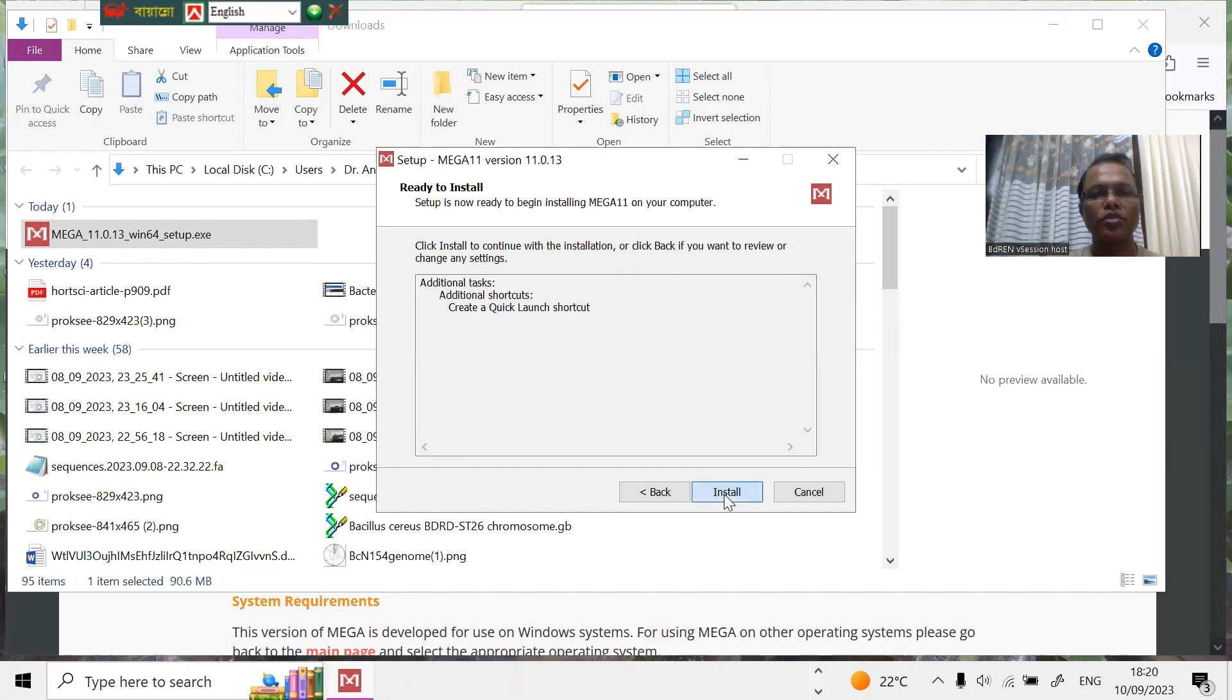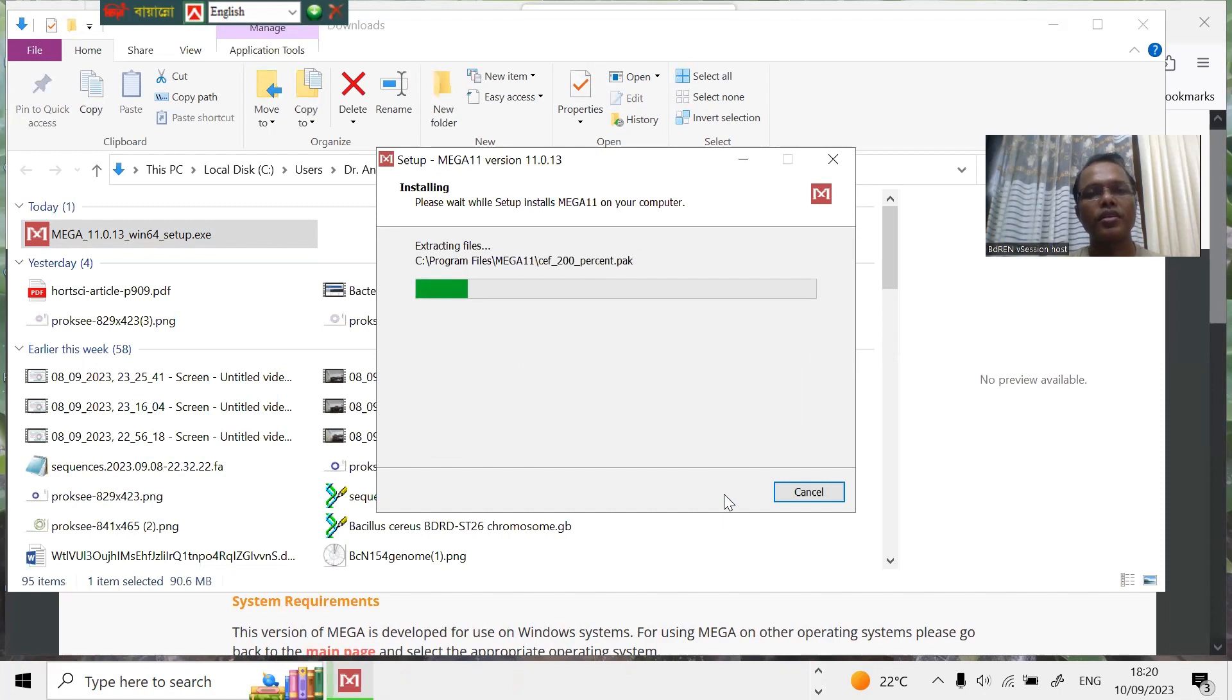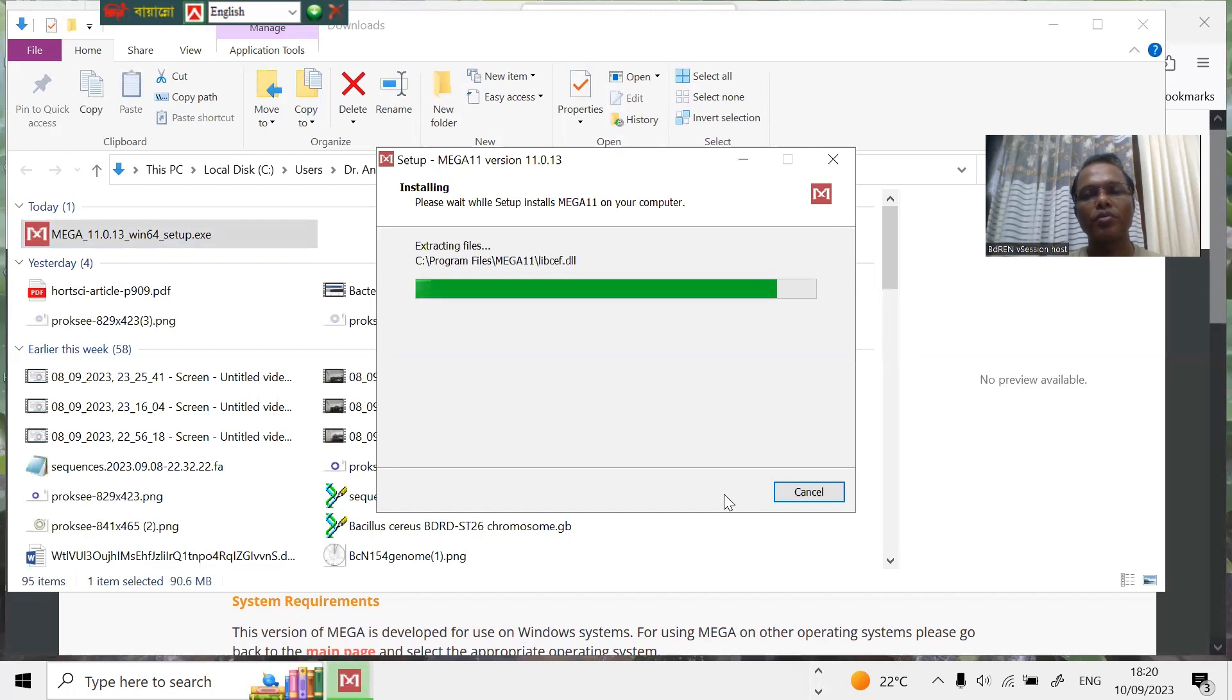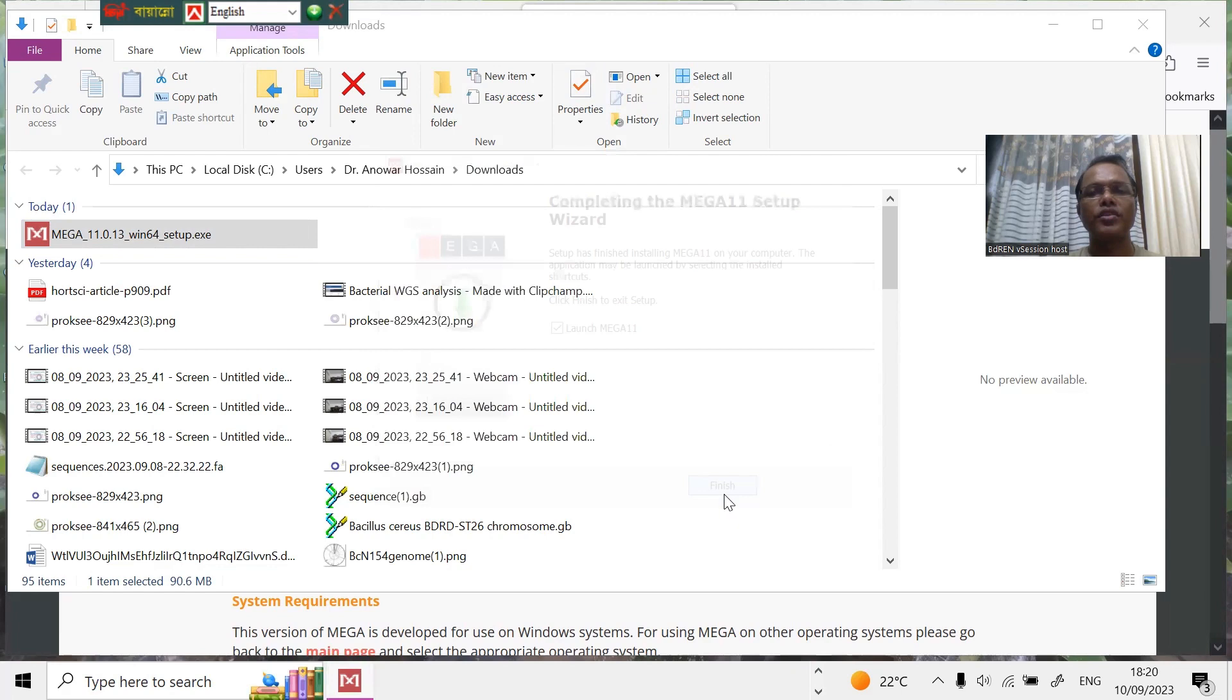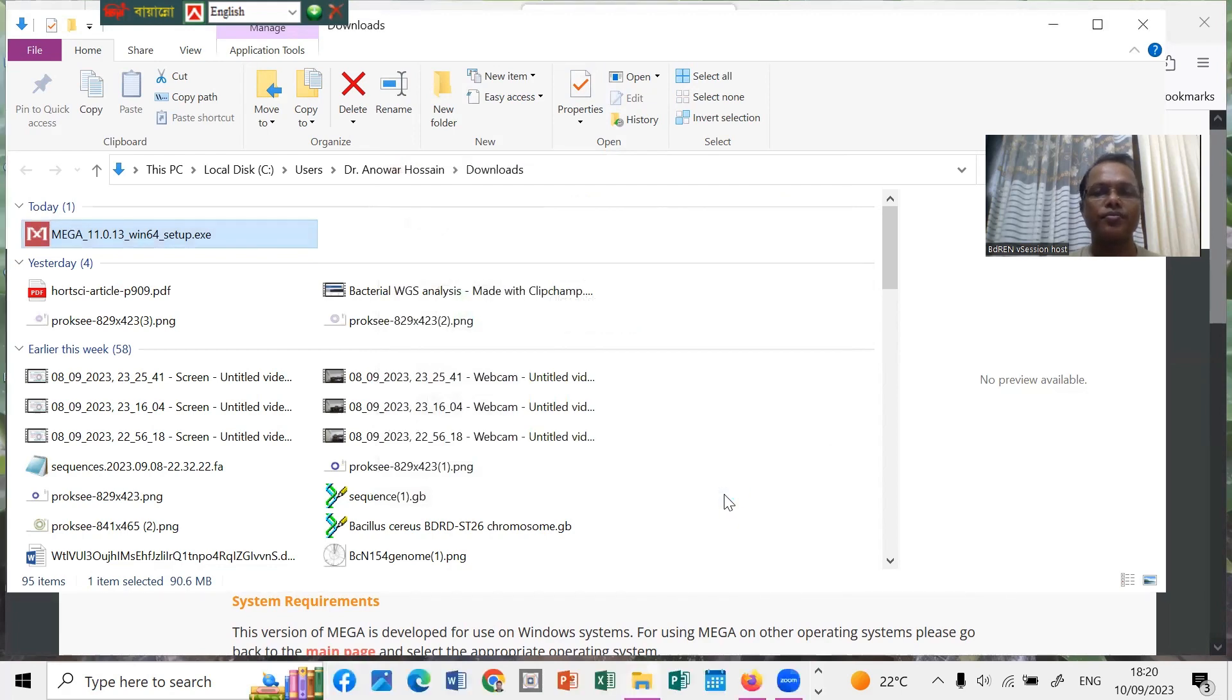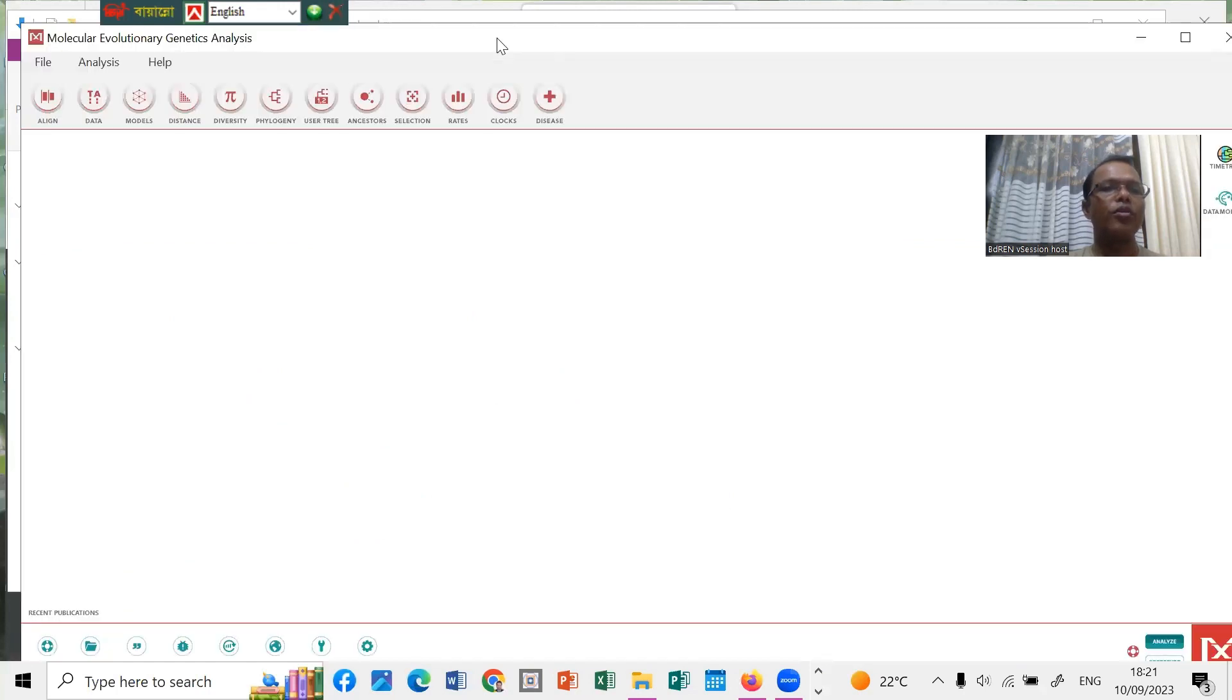It's just finished. You can see now already open, the Molecular Evolutionary Genetic Analysis. This is the software. You can work offline using this software.